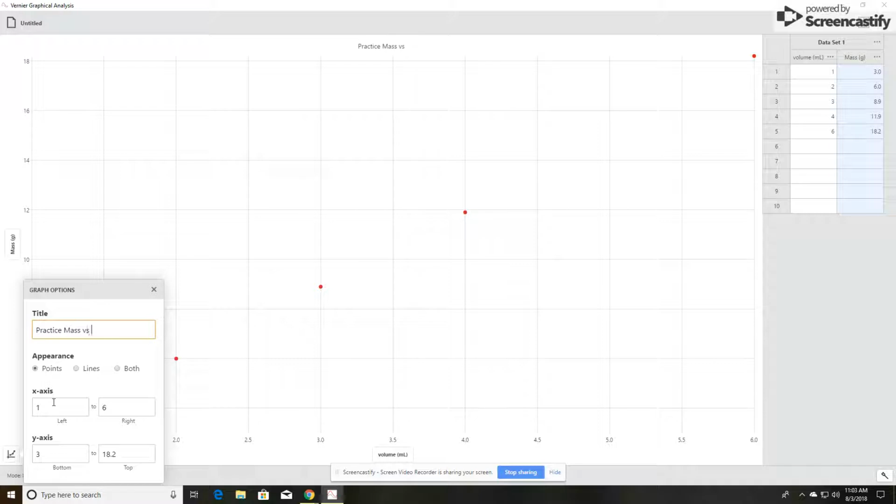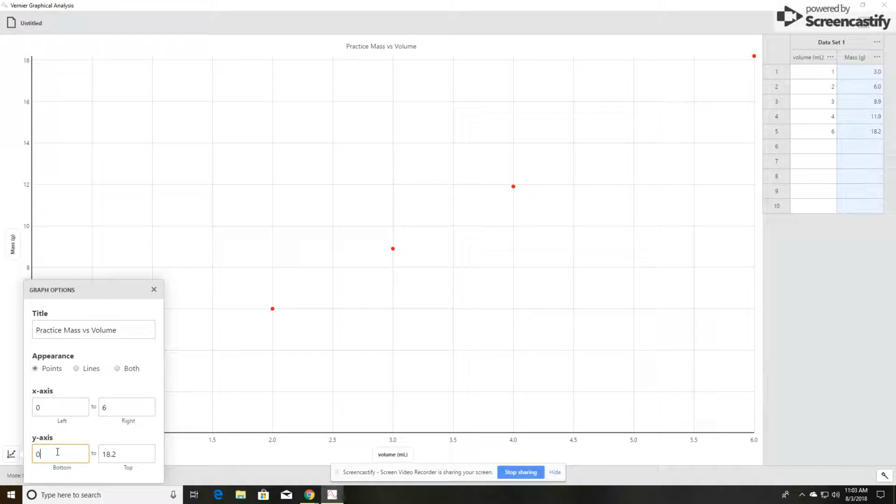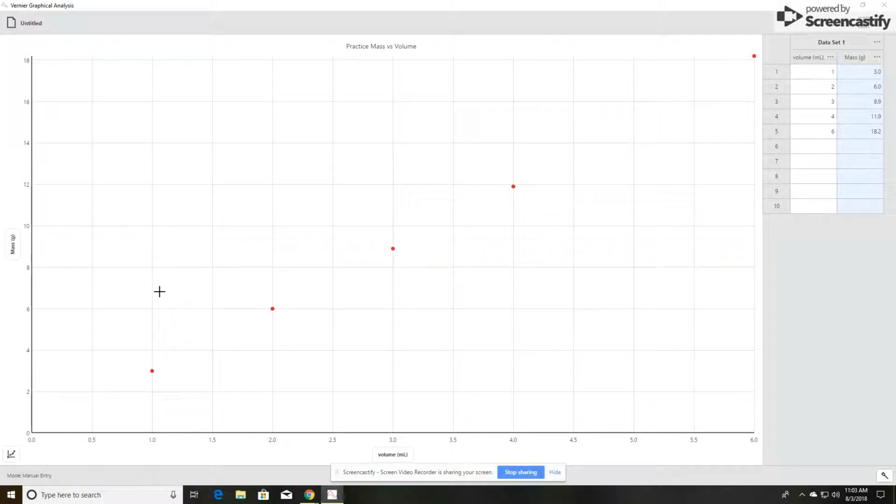Okay. Because we always want to either extrapolate or interpolate. So to help us do that, we can do a curve fit. And the really nice thing about this, it's so much easier than Google Sheets, because although it's not a curve, it gives you a million different options, but it will try to guess which one it is.